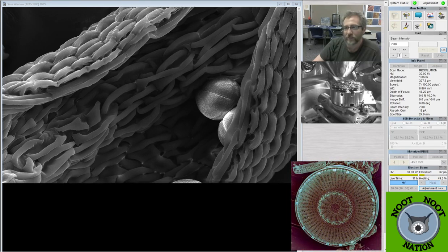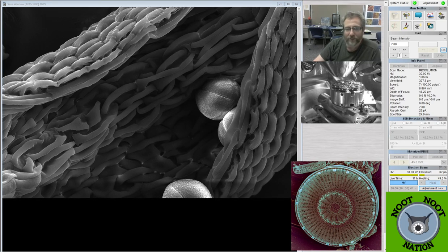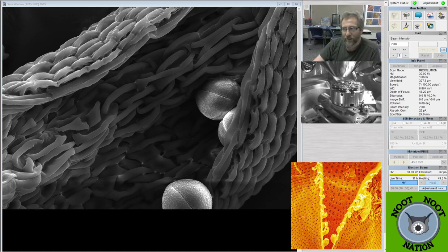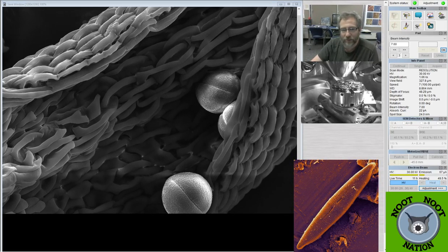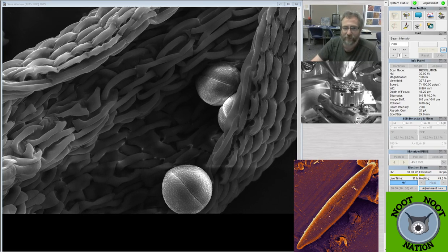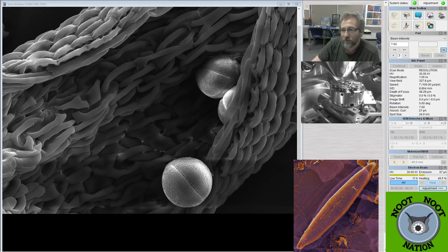Does low vacuum result in a noisier image? Low vacuum usually means you might get a lower quality image out of it. Yeah. It probably wouldn't run as high. You won't get as high magnification, but you can still get good magnification probably. Why don't we always use low vacuum mode? I think because the high voltage gives us a better image. High vacuum, high voltage.